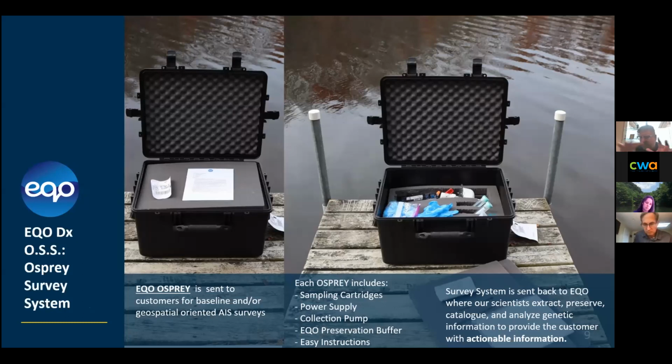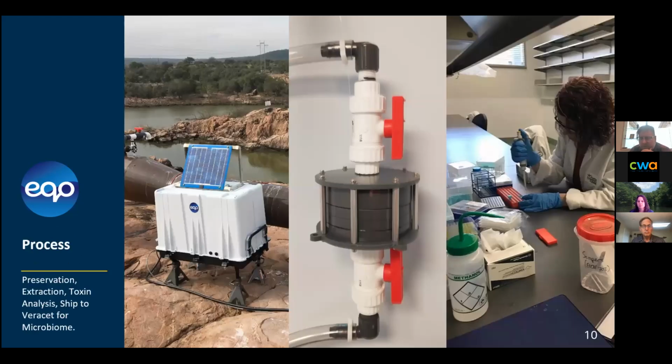And this is for geospatial work. The automated sampler is a semi-permanent installation. It's for a place that you know is going to have issues, and you want to sample on a regular basis, for a temporal space, to figure out eDNA and eRNA, all kinds of things. It doesn't matter what you're sampling for, but all kinds of invasive species, native species, or biosecurity threats. This one is for when you want to get on a boat and take a bunch of points around a lake and understand a baseline at a single point in time. So we have geospatial and temporal applications here.